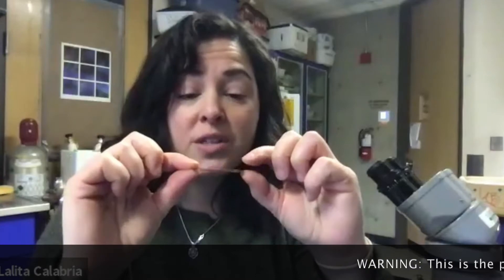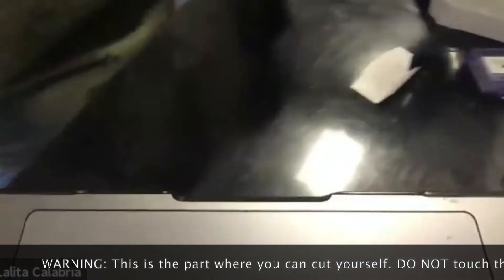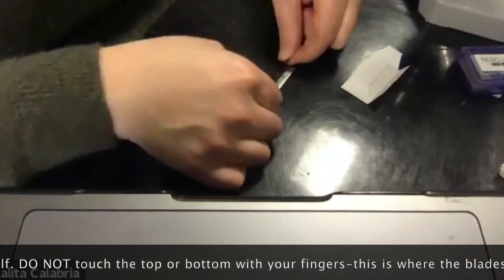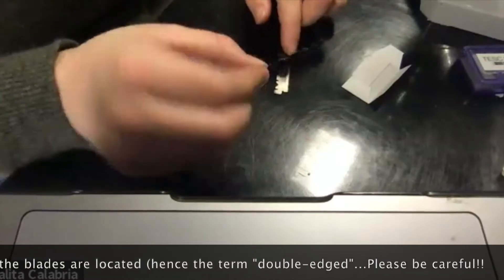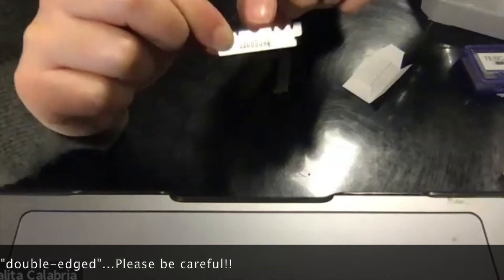Okay, so carefully open this and grab it by the side. You'll see that there's a razor on the top and a razor on the bottom. You're going to want to carefully fold this in half — just hold it by the two edges, set it down, and fold it in half so it breaks into two pieces. Now you have two equal pieces: this is the side with the sharp razor, and this is the side that you can handle.